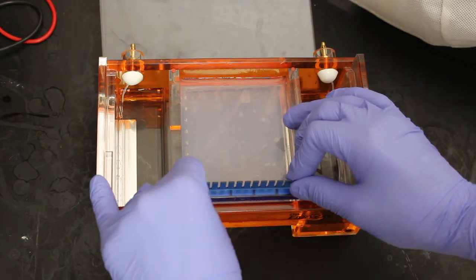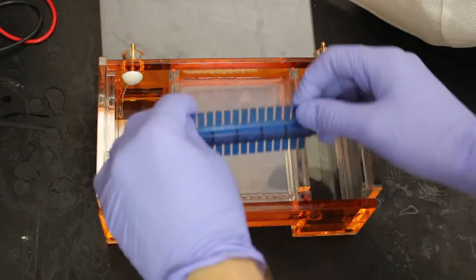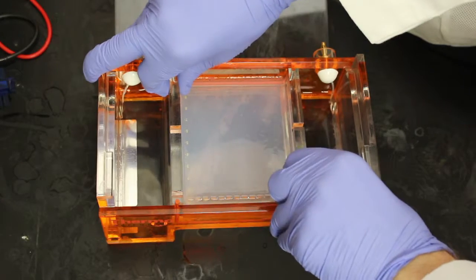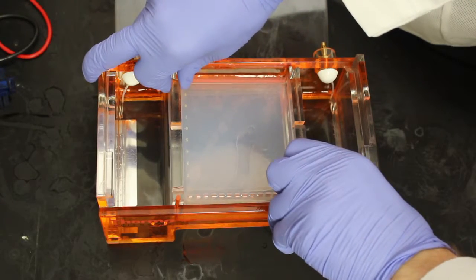Once the gel forms, carefully remove the well mold. Here, we remove the mold with the gel and place it in its proper orientation.